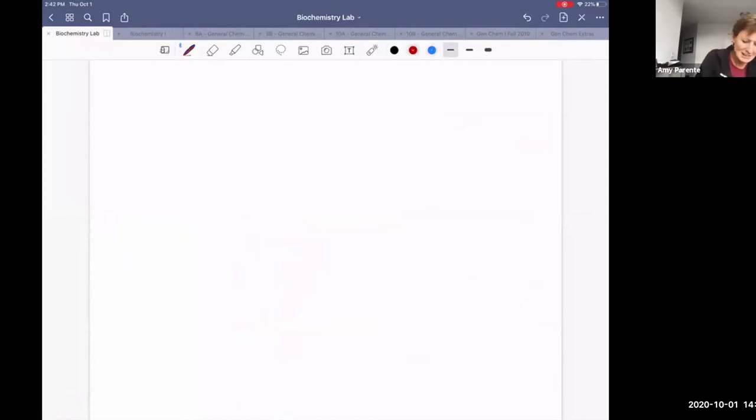So I want to just highlight what this program is that we do. I'm going to tell you what the steps are. It's not a super user-friendly program, so I'm going to tell you what the instrument would say, but more importantly we're going to talk about what it means. The first thing it's going to say is collect all. These are literally lines of program that you see. It's going to say collect all, 3 minutes, and 1 milliliter per minute. So that's what the instrument will say in red.